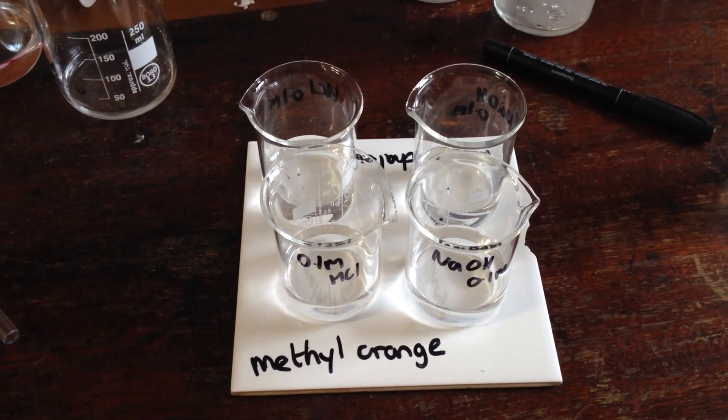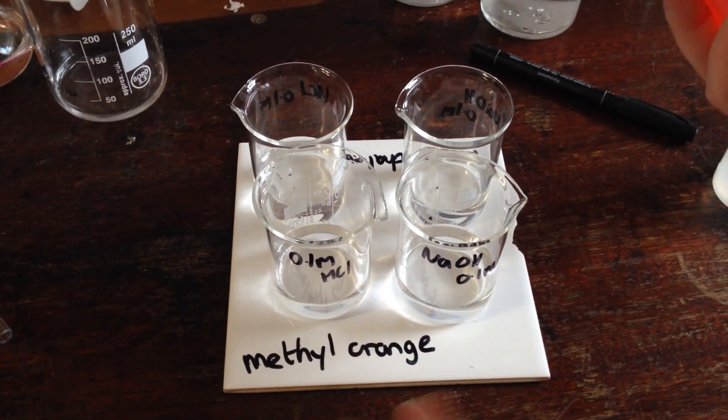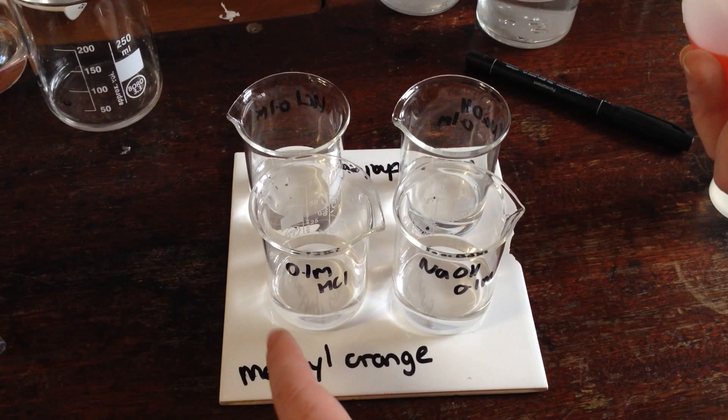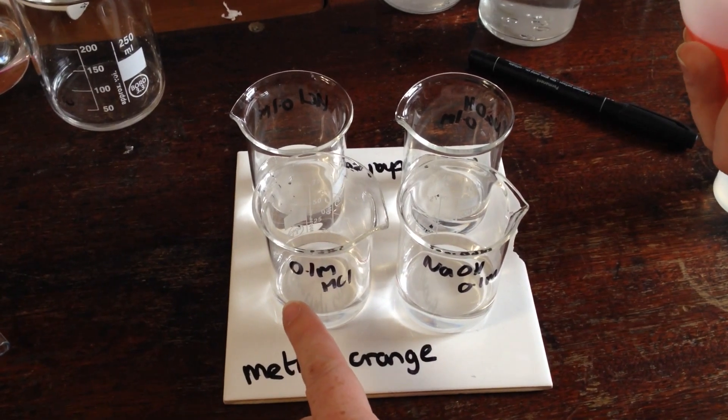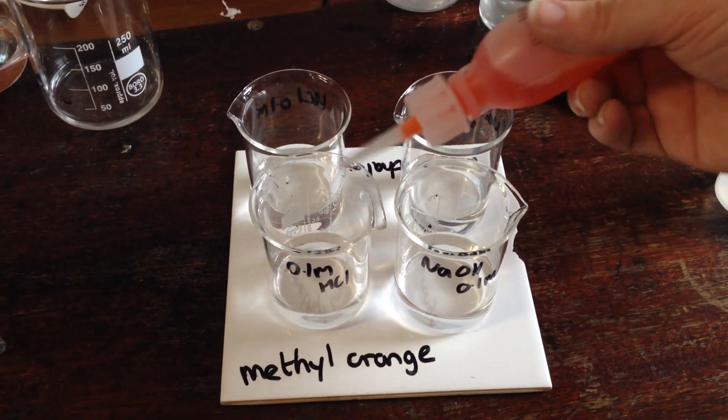Here I'm going to show you what different indicators look like in acid and alkaline. We start with methyl orange, and we have 0.1 molar hydrochloric acid and sodium hydroxide.